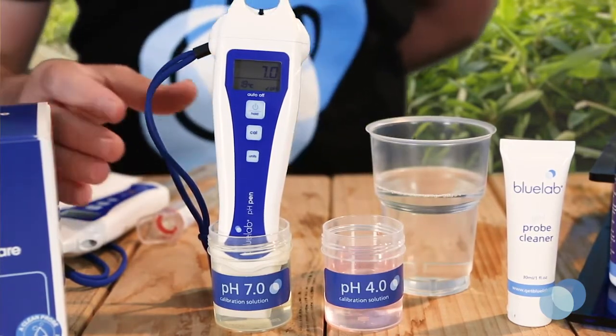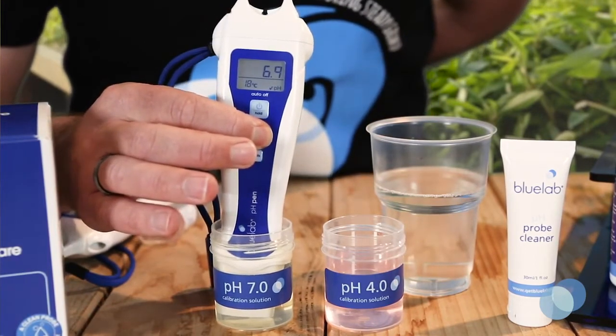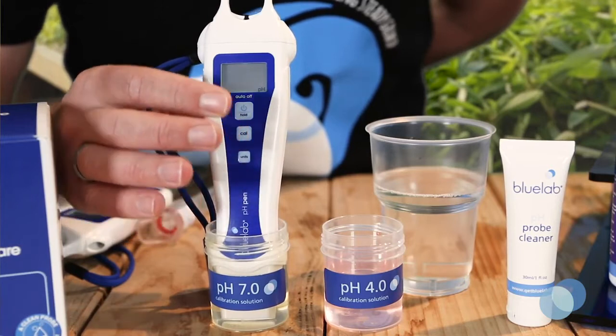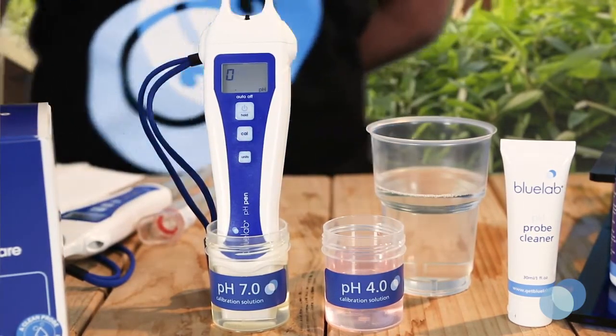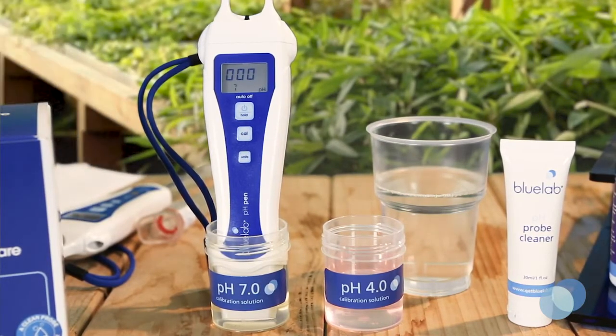Press and hold the Cal button until Cal is displayed on the screen, then release the button. Four small boxes start to flash, indicating the start of calibration. Leave the probe in the solution while the display is flashing. After the boxes stop flashing, you'll see Cal displayed on the screen, showing you that calibration is complete.